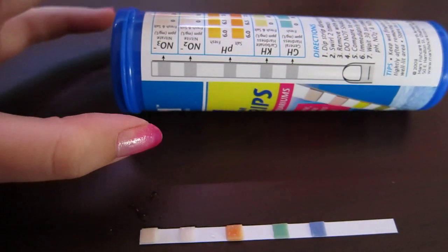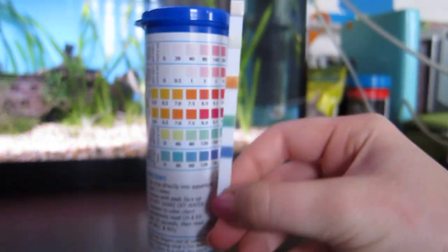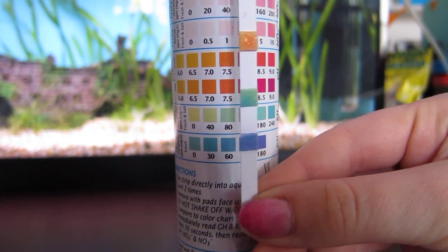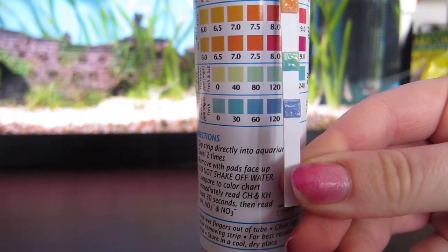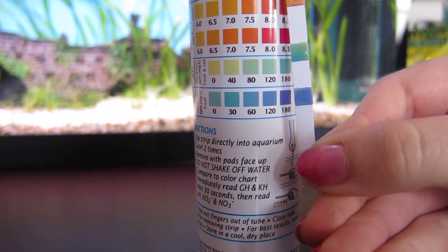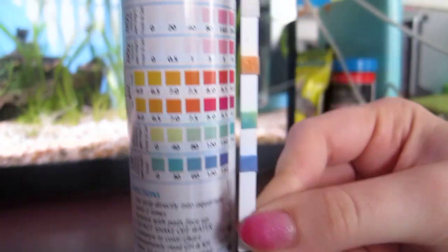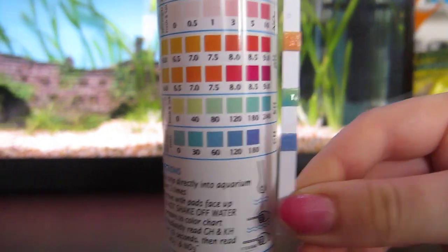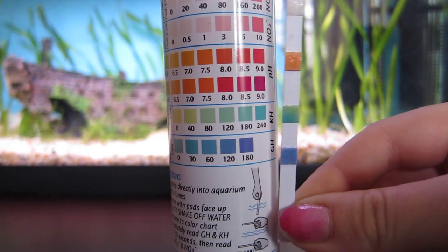I'll just hold it up — that might work a bit better. The bottom pad seems to be around the darkest color, probably somewhere between 120 and 180. The GH and KH pad seems to be around 180 to 240 — it's sort of multicolored so it's hard to tell exactly, somewhere between those two values.